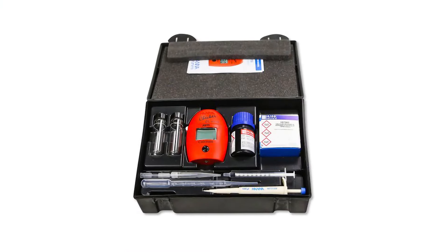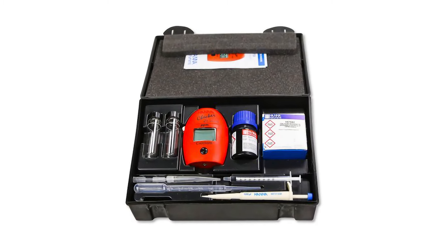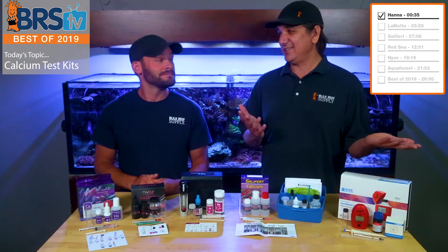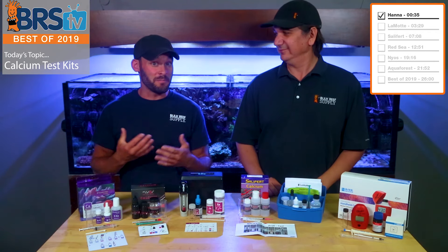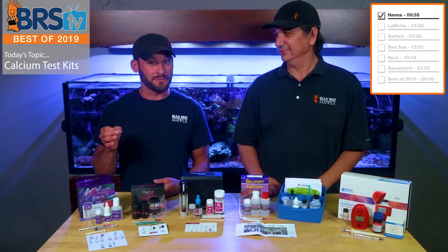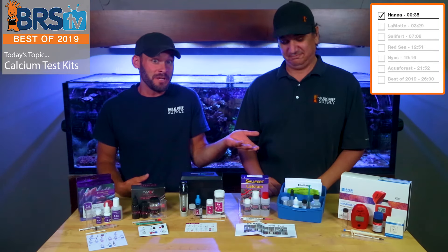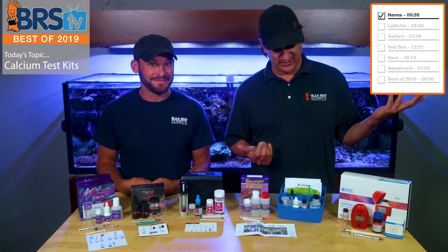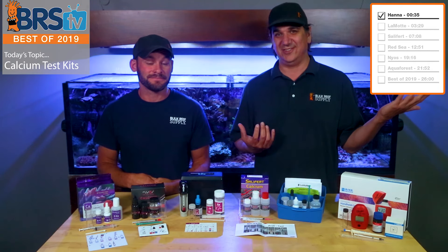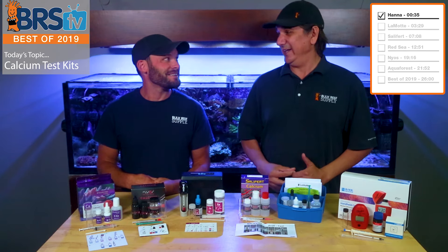We're gonna start with the Hanna Checker here. This is actually the second most expensive thing on the table. The biggest thing is it's a digital readout, so if you don't like to read colors or if you can't read colors because you're colorblind, this is the one for you. The biggest benefit is definitely that you get to see a digital number come on the front, but that's about where it stopped for me.